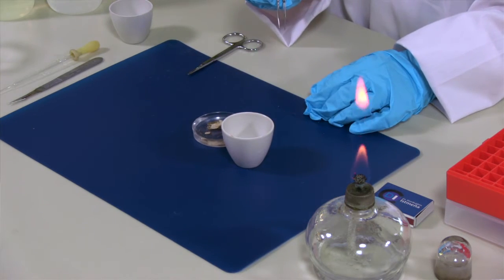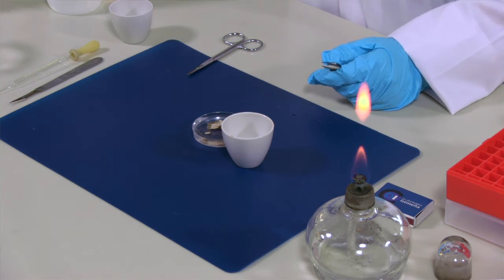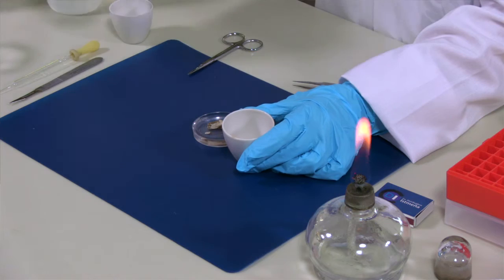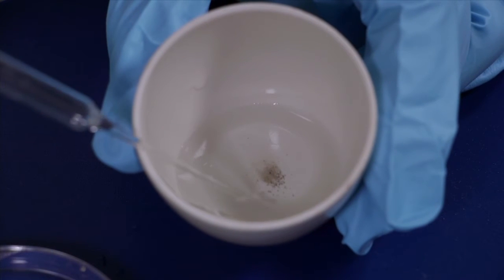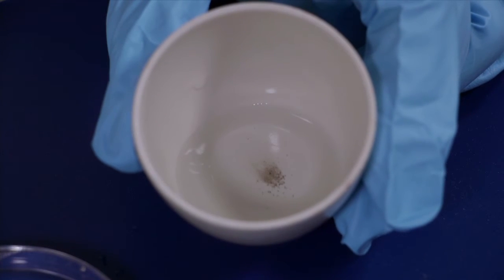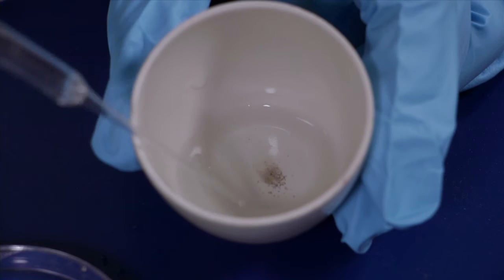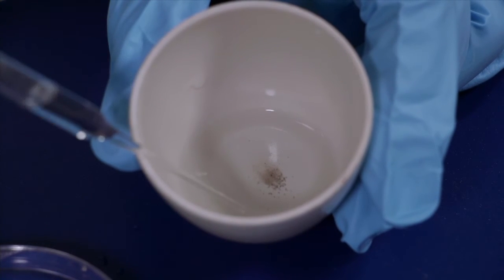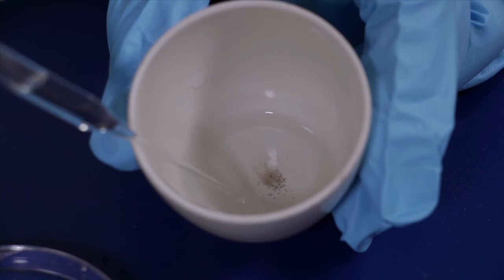There are still residuals of tissue in this preparation, so I'm going to use bleach to get rid of these residuals. After about 15 to 20 minutes in the bleach, it's time to wash the preparation. The spicules are accumulated in the bottom and I'm taking only the liquid out. Be careful not to disturb the spicules because they are very tiny and you don't want to pipette them out.